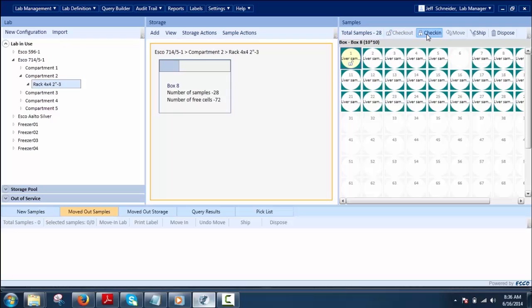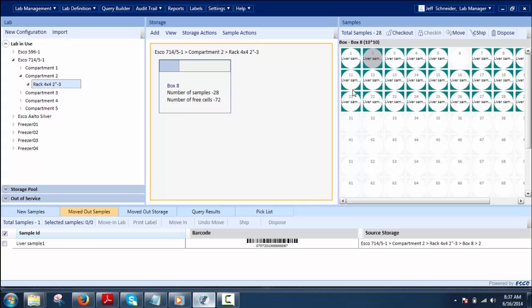Check In allows users to check samples back into the system after processing. The user can perform this operation on single or multiple sample selections. Move transfers the selected sample from the sample clipboard to change its location; these moved samples are placed in the Move Out Samples clipboard.